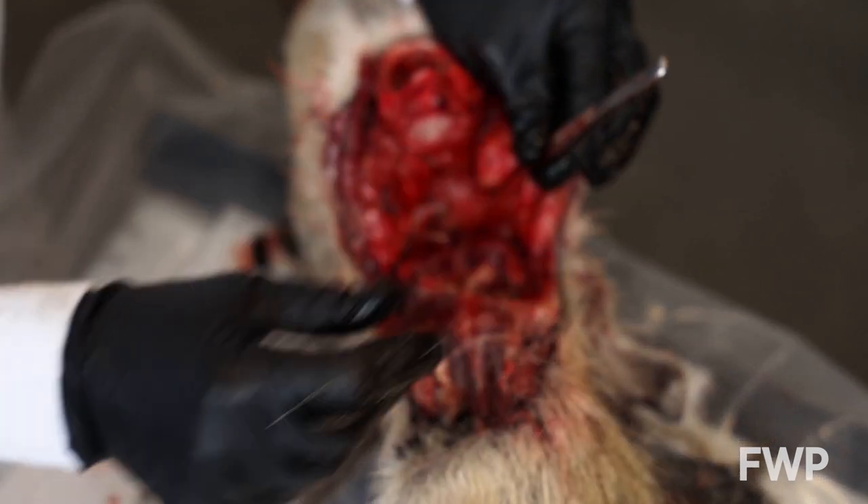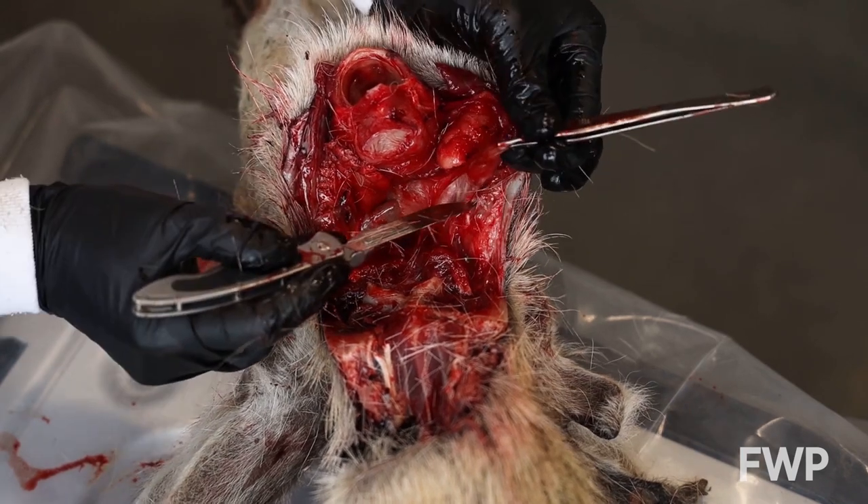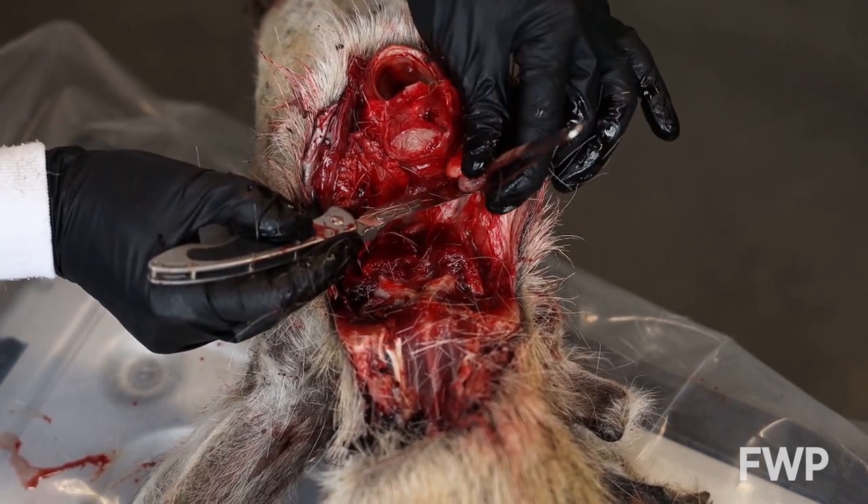Once the lymph nodes are identified, remove them by cutting away the adjoining tissue. Then place them in a sealable plastic bag for storage. They should be kept cool or frozen.